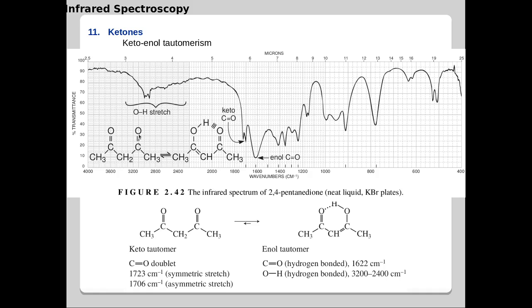The carbonyl stretching vibrational frequency of the keto structure. Then you shall expect the carbonyl stretching vibrational frequency of the enol structure here. This one is the enol structure. And then you shall also expect the OH stretching vibrational frequency of the enol. So unlike a classic ketone, you shall expect the stretching vibrations of the carbonyl functional groups of both the keto form and the enol form. Then the OH stretching vibration as well, in addition to the hydrocarbon framework or bond vibrations of the molecular system here.